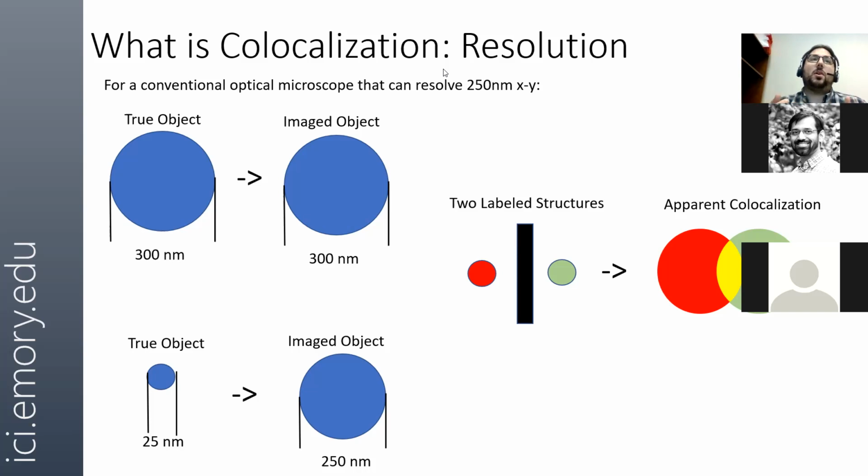But if both of your objects are very small, it's harder, almost impossible, just with co-localization to then say these two very small objects are co-localized in our data, therefore they're interacting. Most you can say is they're in a similar region, but to prove that they interact with each other directly, you'd need a little bit more. You'd need something like FRET. Does that make sense?